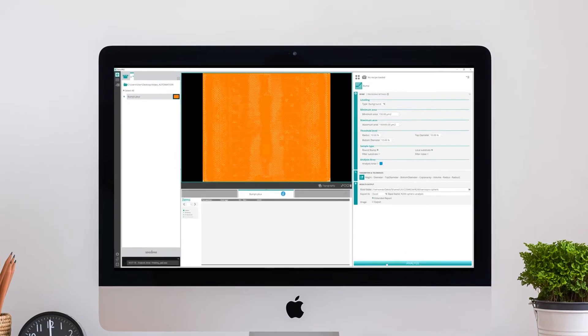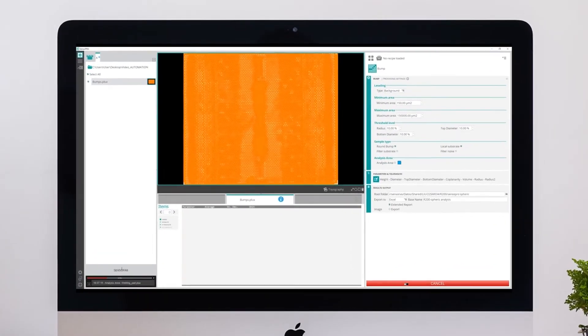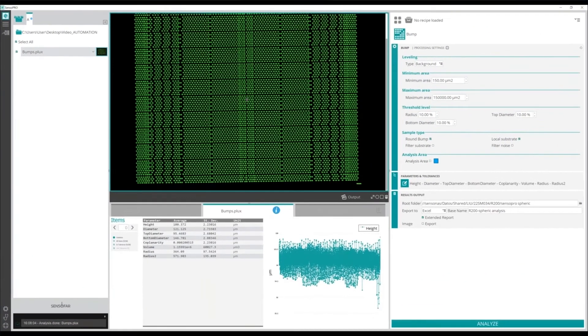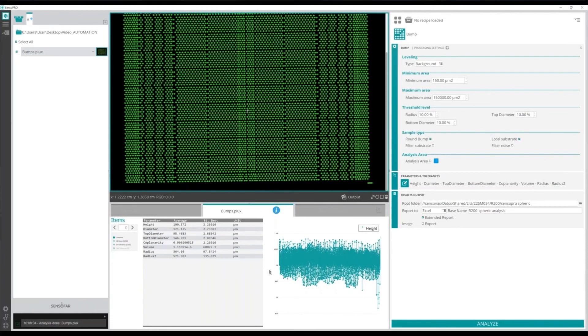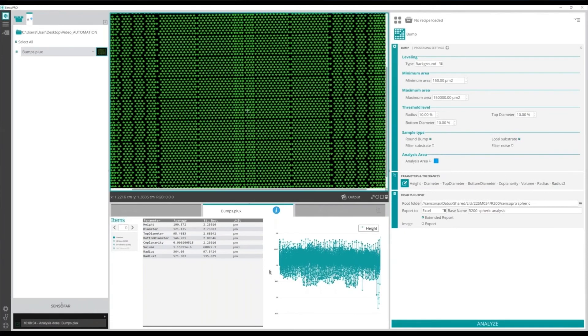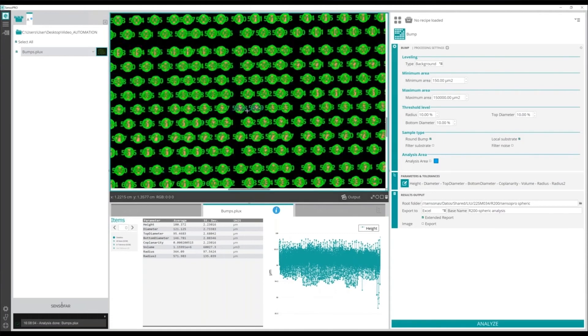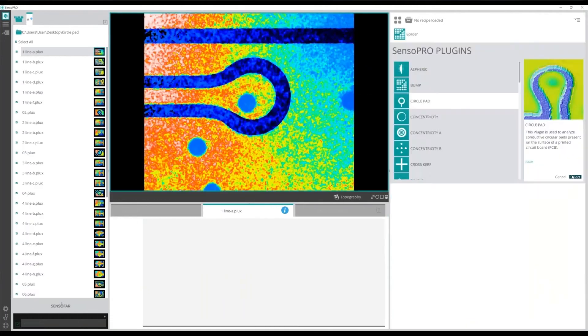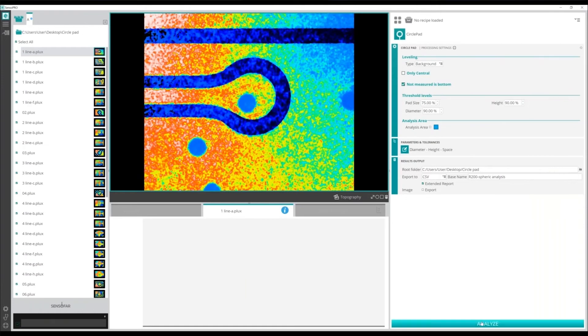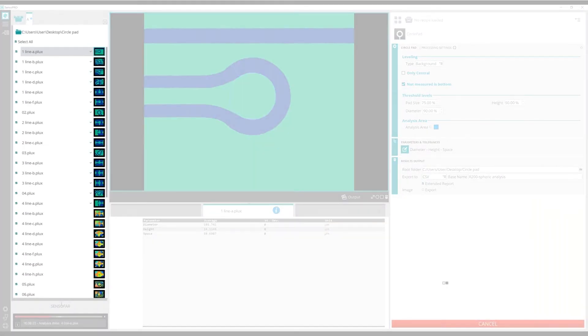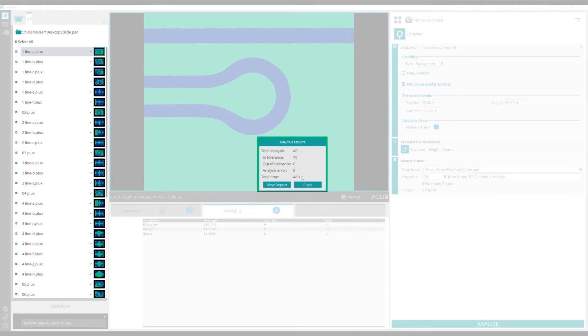The throughput of Senso Pro matches the speed of a QC environment. For instance, it can detect more than 8000 bumps in 20 seconds or it can detect features of interest in 40 different files in only 48 seconds.